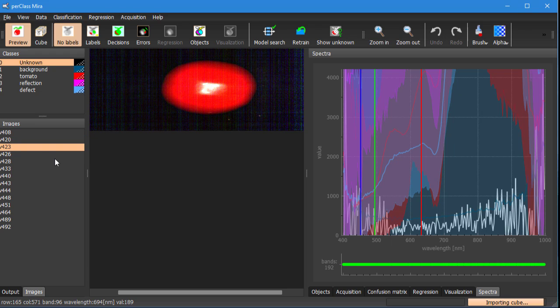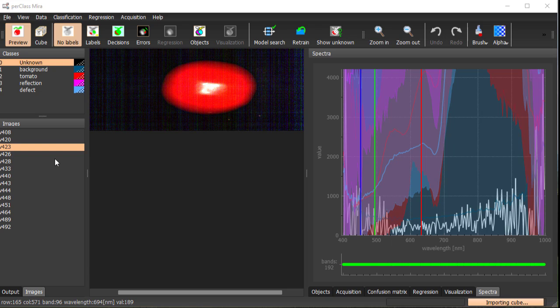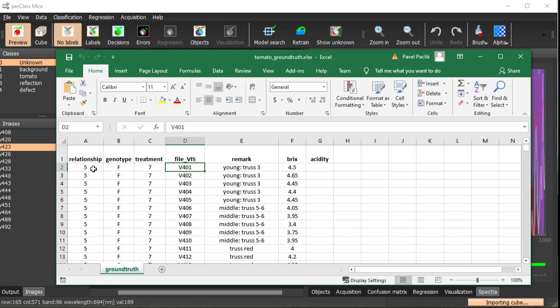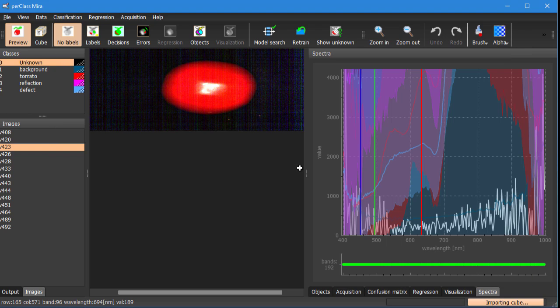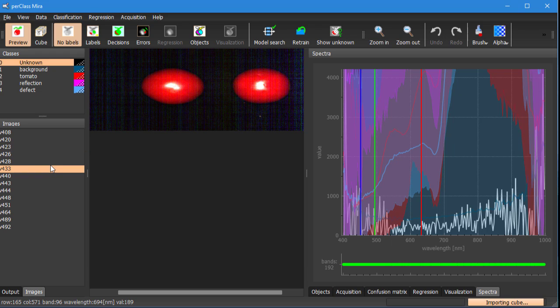We also have a separate Excel file that is listing for each scan what was the value of bricks of sugar content that was measured in the lab destructively after the scanning. Our goal is to build a model that will be able to predict for any new scan sugar content for each tomato.